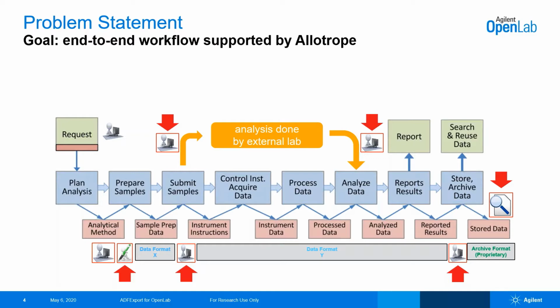So the reuse of data is not an easy task today in laboratories, and it's needed most. Also, the exchange of data internally from one lab to another lab, or the external exchange of data to contractors, which is very common in the pharmaceutical field, especially with contract manufacturers, is hard to do, and the transfer of protocols needs approval to ensure correctness and validity of the data.